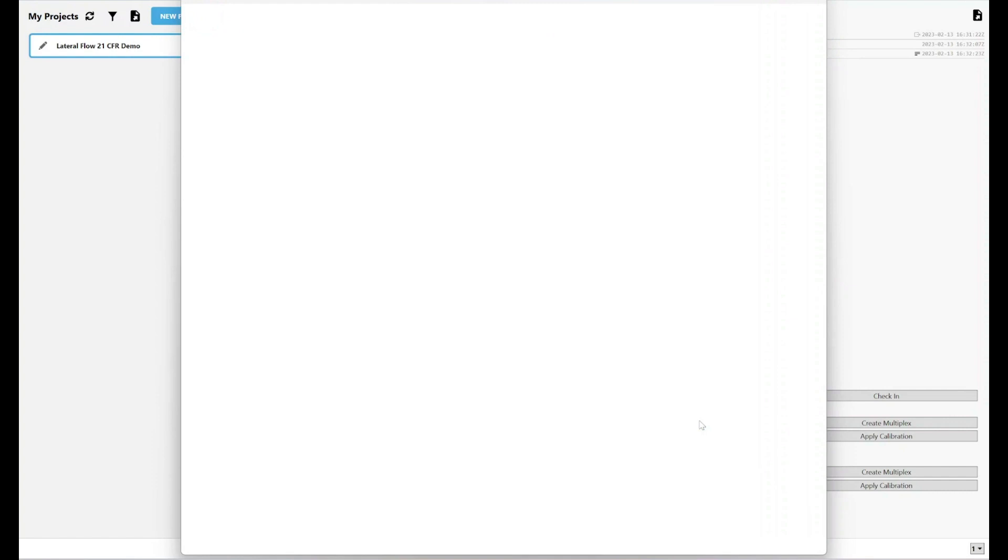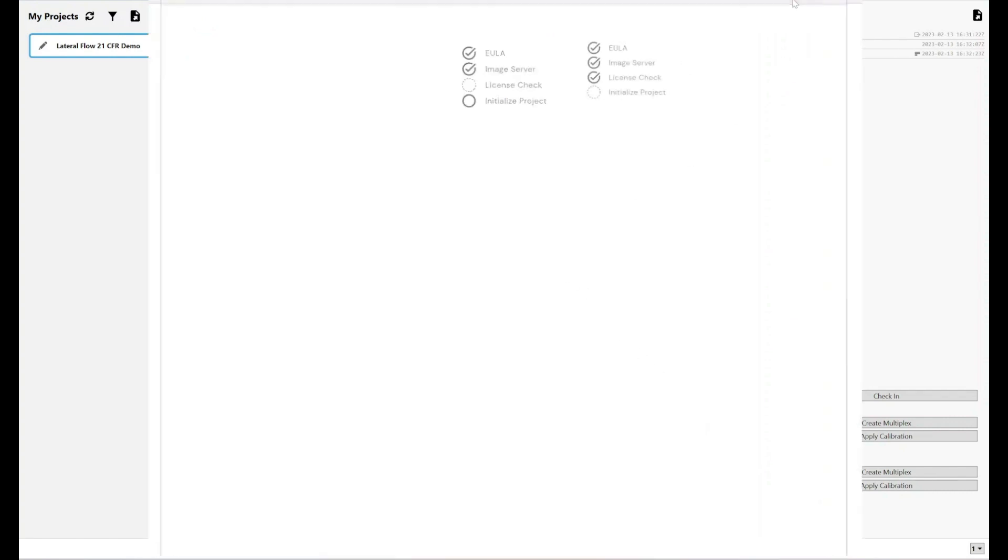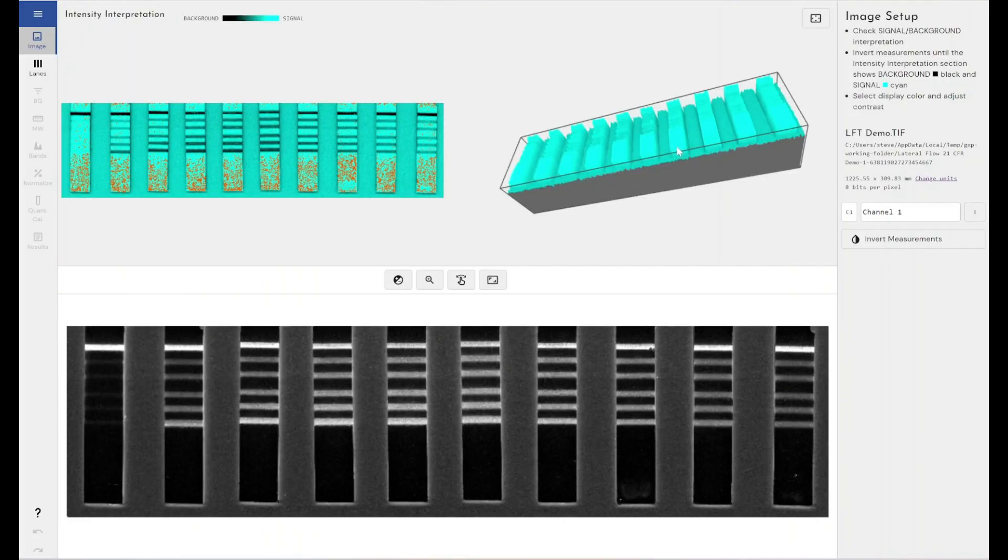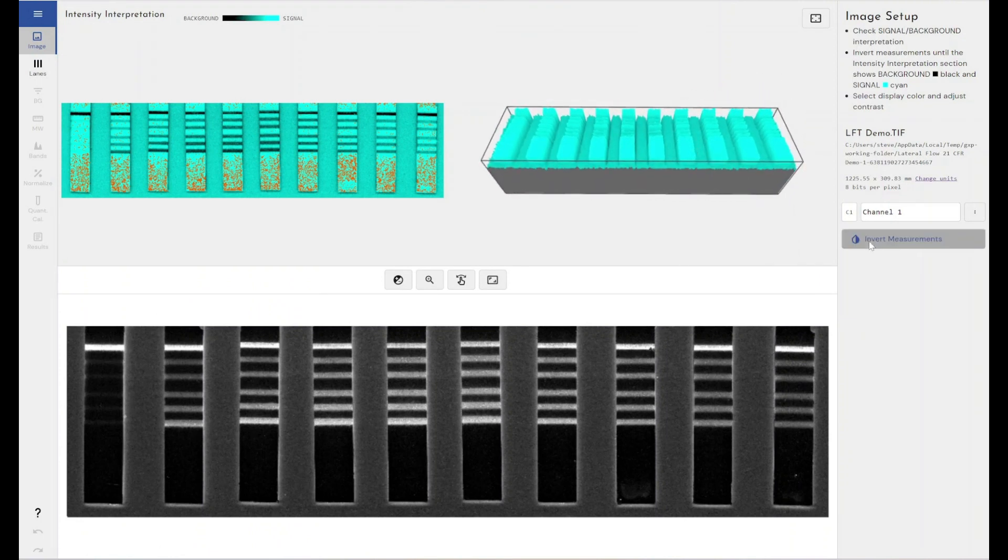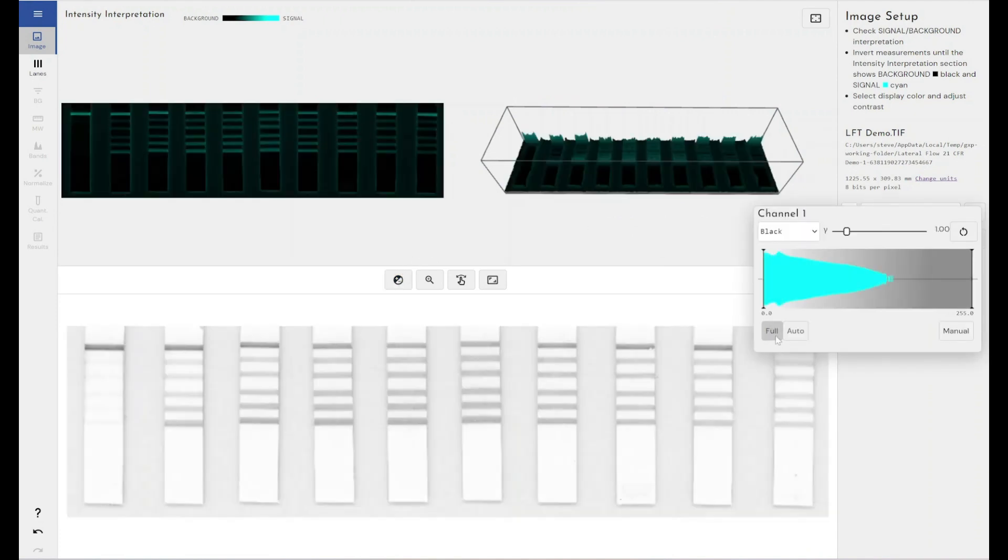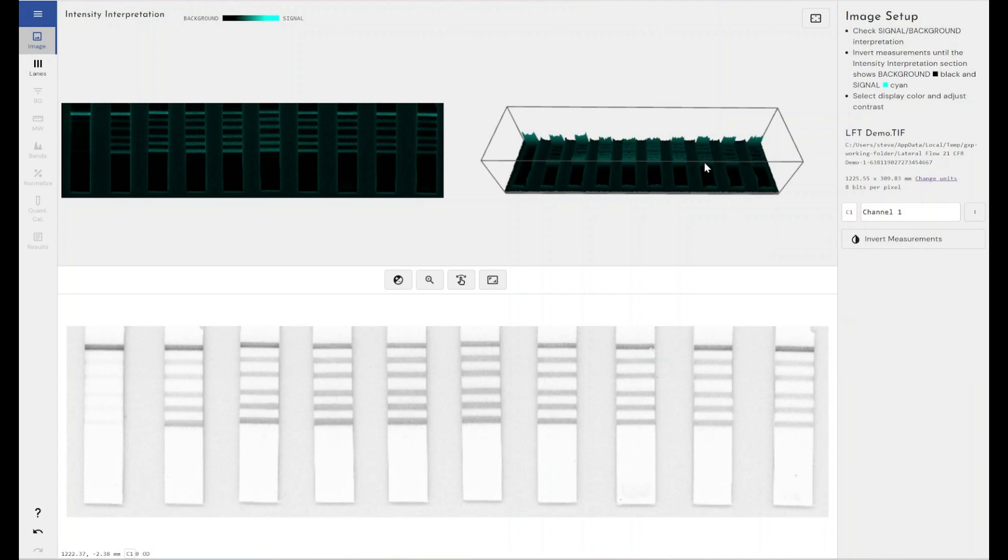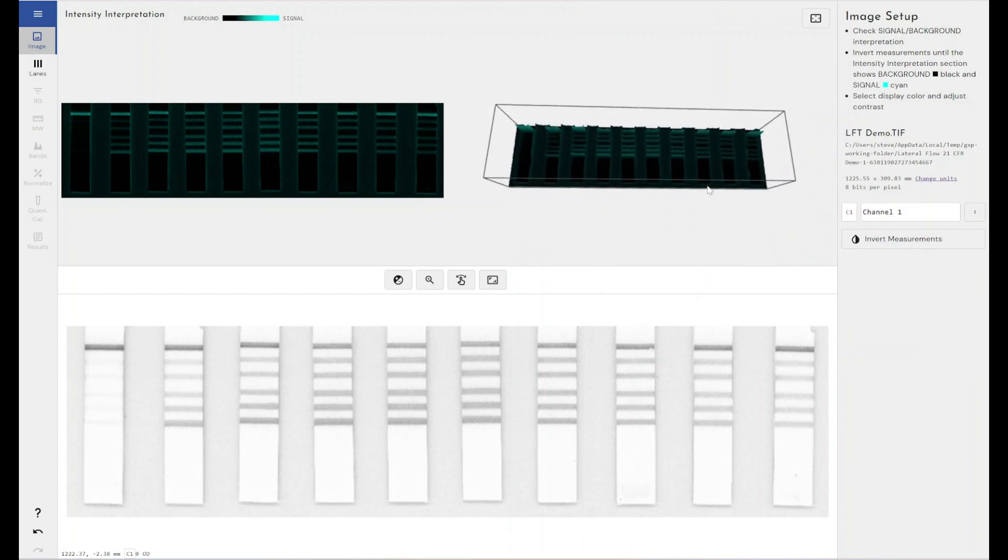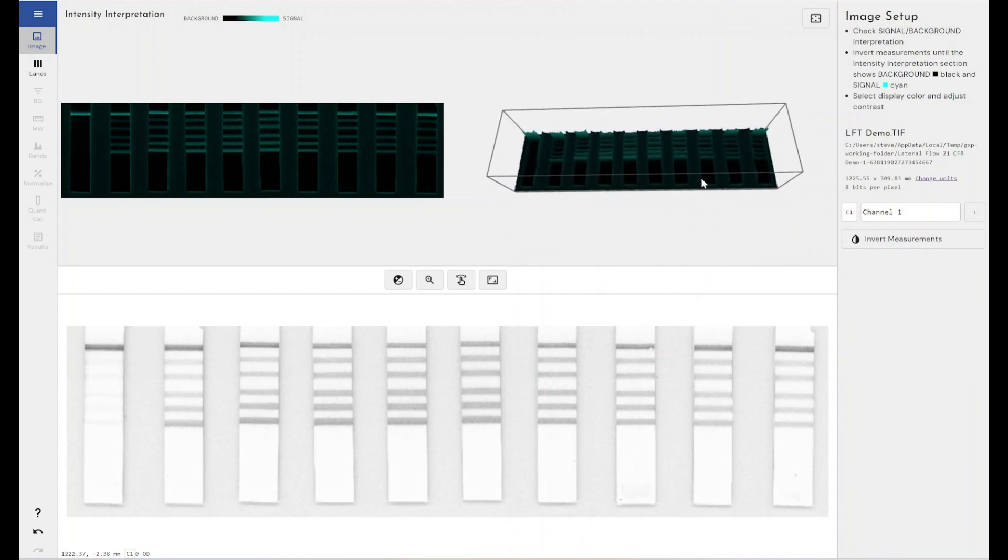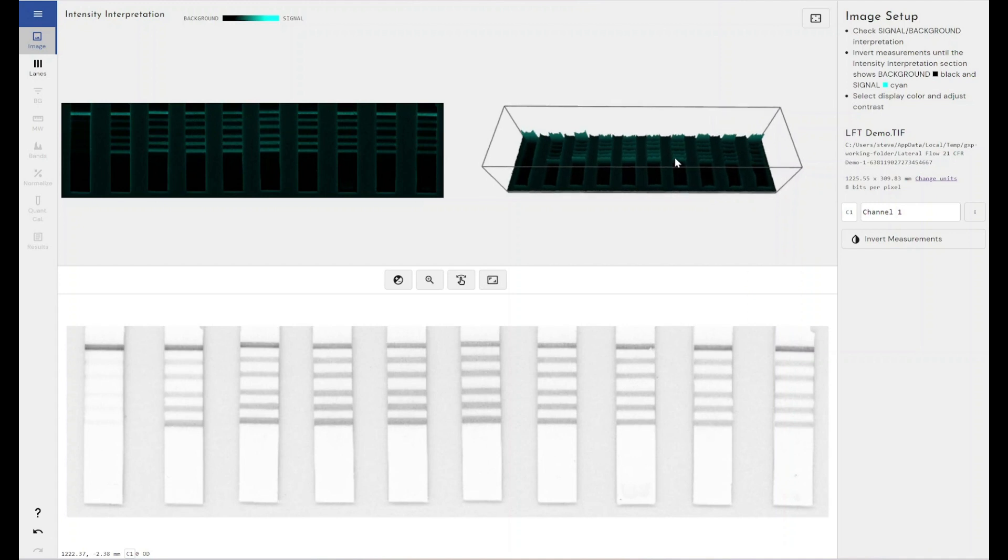What I'm going to do is I'm just going to open this in Phoretix 1D. If I click on Analyze, you get this familiar image from the other video. This is my standard lateral flow test image that you'll recognize from my previous video. I'm just going to go through and analyse it briefly just to show you what happens and how the audit trail is formed as I make my analysis.